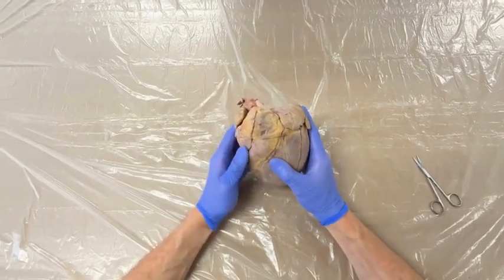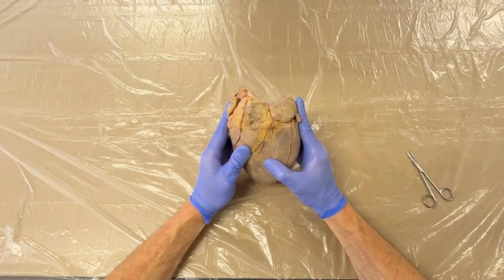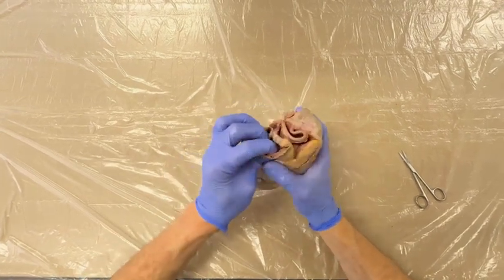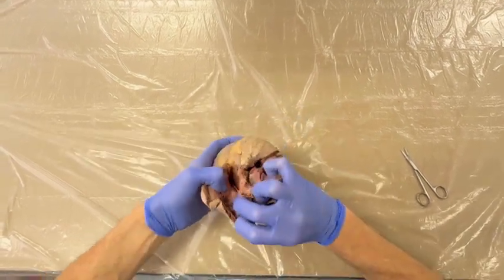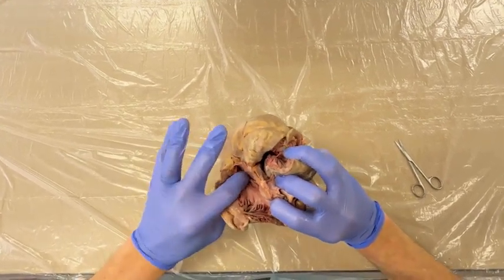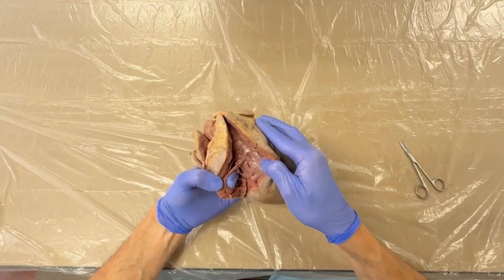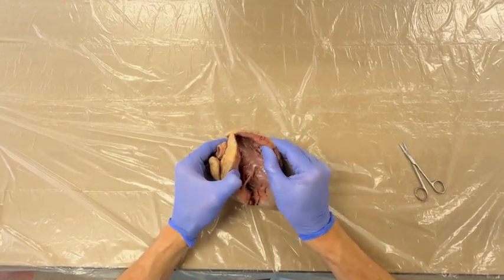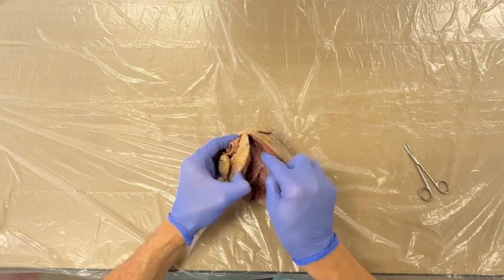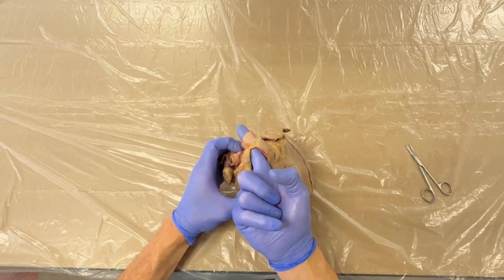So we're going to recap the blood flow through the mammalian heart. So this is a fully dissected pig heart specimen. And so on the right side, blood enters through the vena cava into the right atrium. It flows across the atrioventricular valve on the right, called the tricuspid valve, into the right ventricle. The right ventricle is relatively thin-walled because the pressure is low. Blood pumps out of the right ventricle across the pulmonic valve to the pulmonary artery.